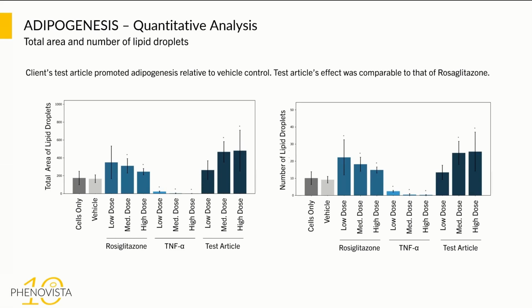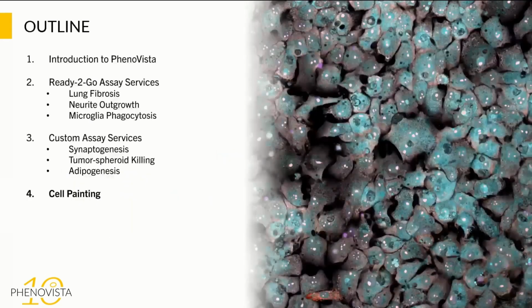Such as maybe even fatty liver disease models, and create different models to test our clients' different test articles for different disease areas.